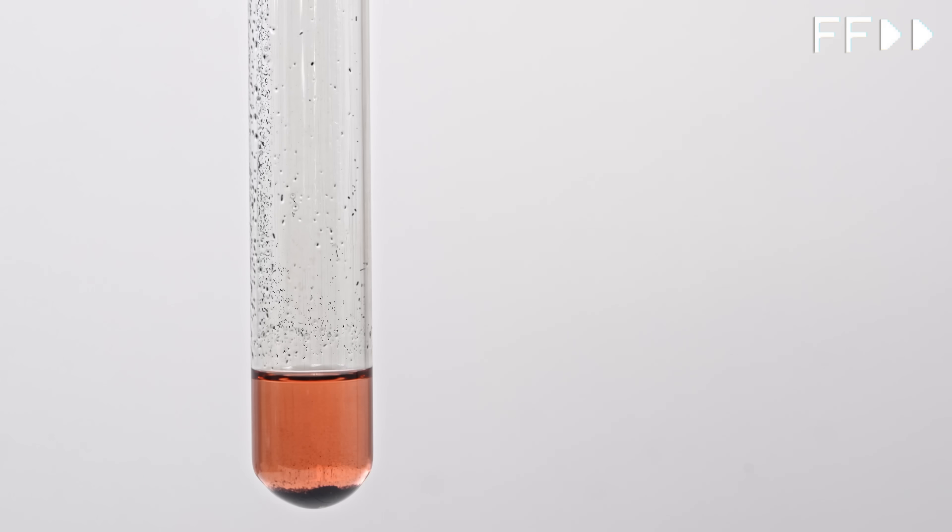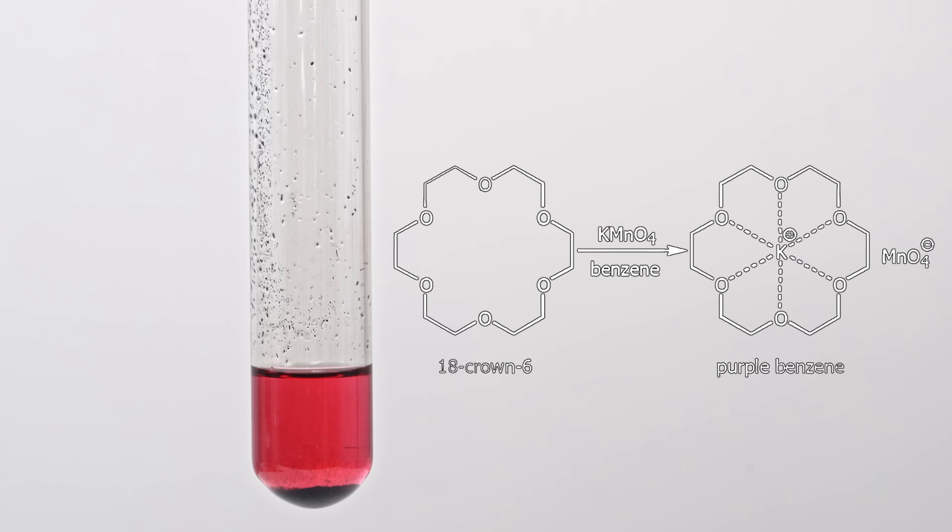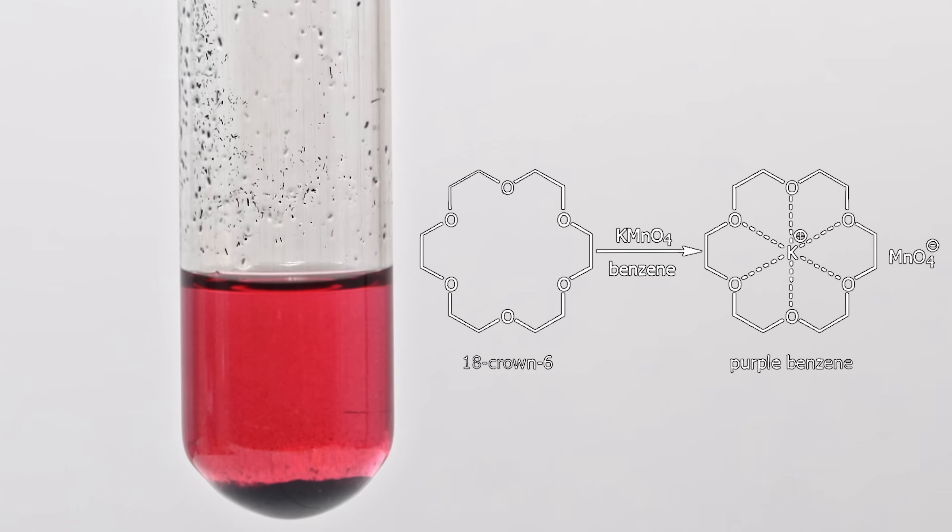This results in an ion pair that's soluble in benzene. When I mix the contents of the test tube, the benzene takes on the purple color characteristic of potassium permanganate solutions. By the way, this is known as purple benzene, and is reactive enough to oxidize toluene into benzoic acid.